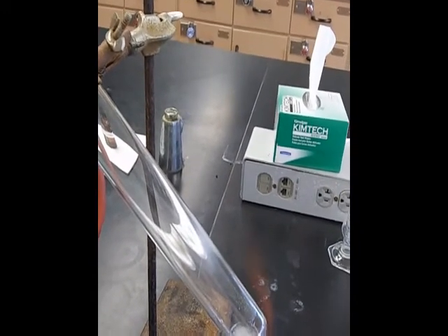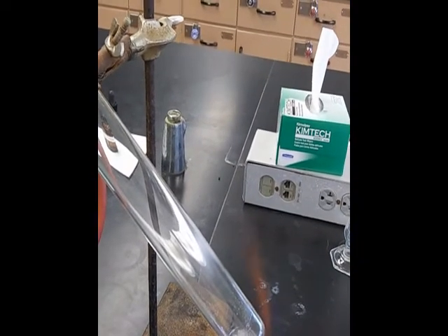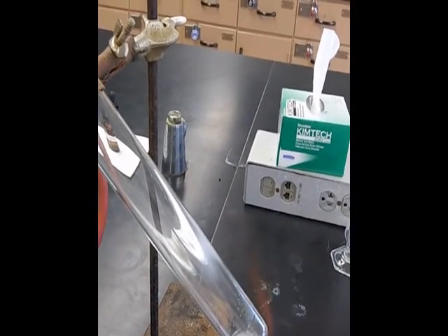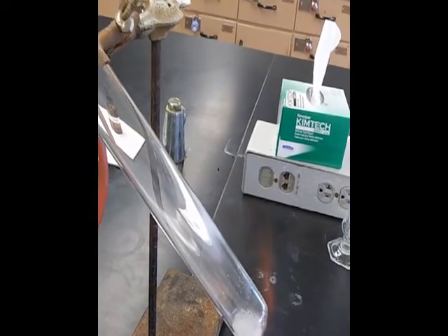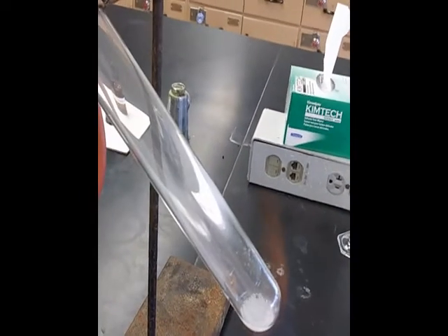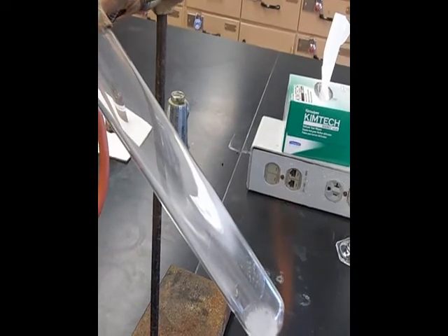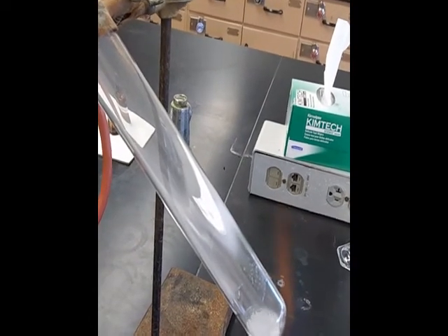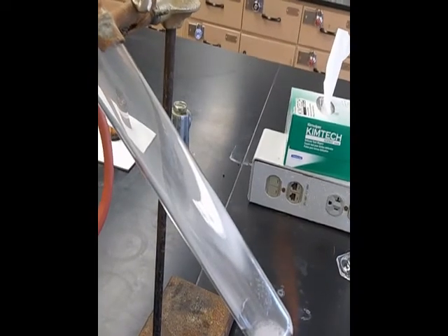And I'm keeping my eye on the beaker over there to see the water that's being delivered. And I just got to take it kind of easy and not make it explode and shoot this cork across the room. So can you really see it bubbling there? Okay. And then once I get some water going over at a decent rate, I'll switch my perspectives here.